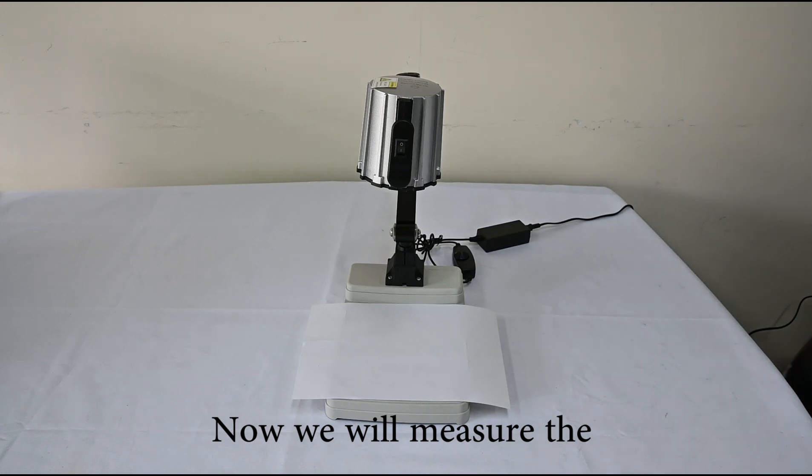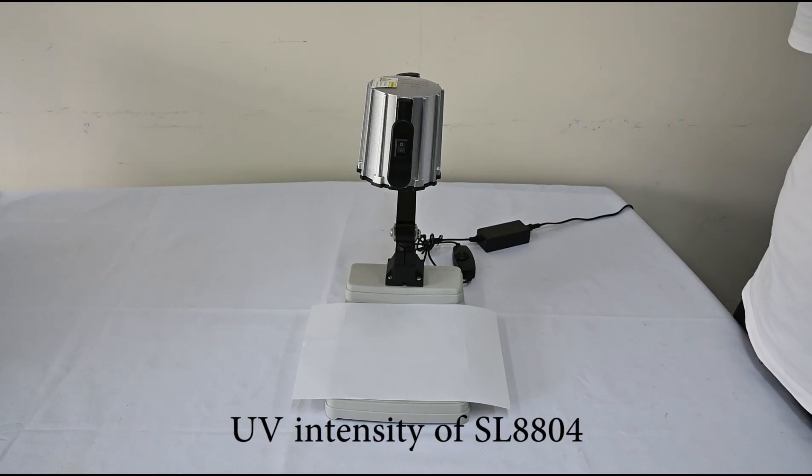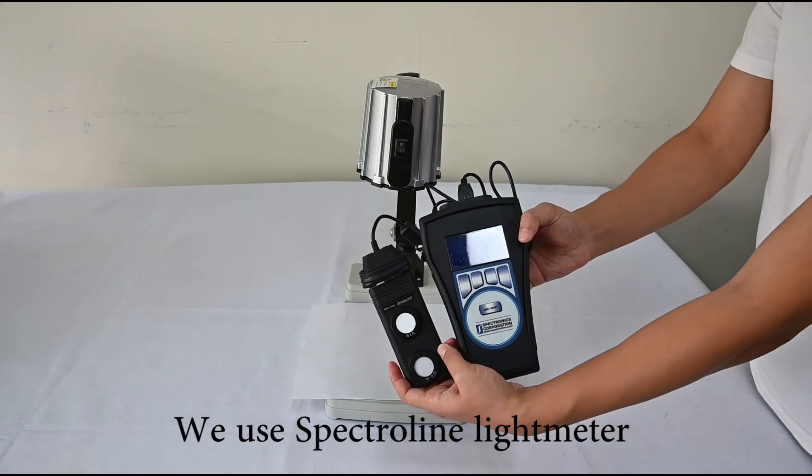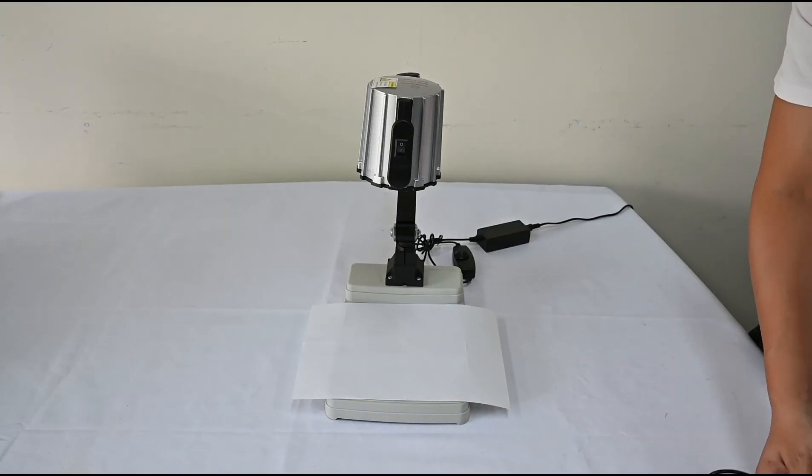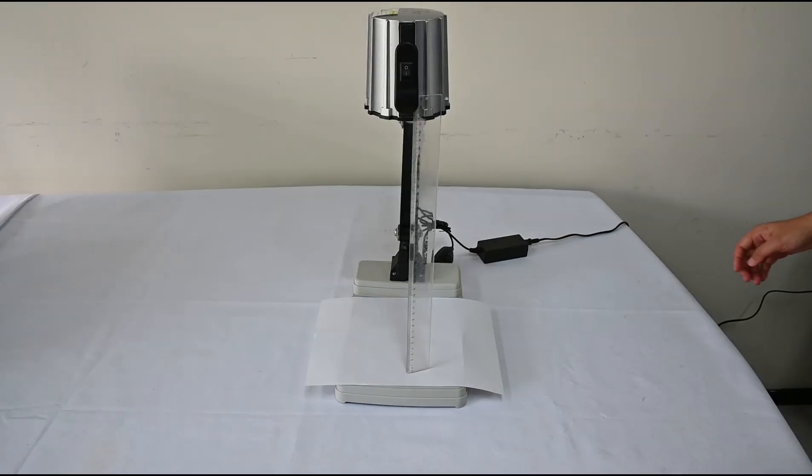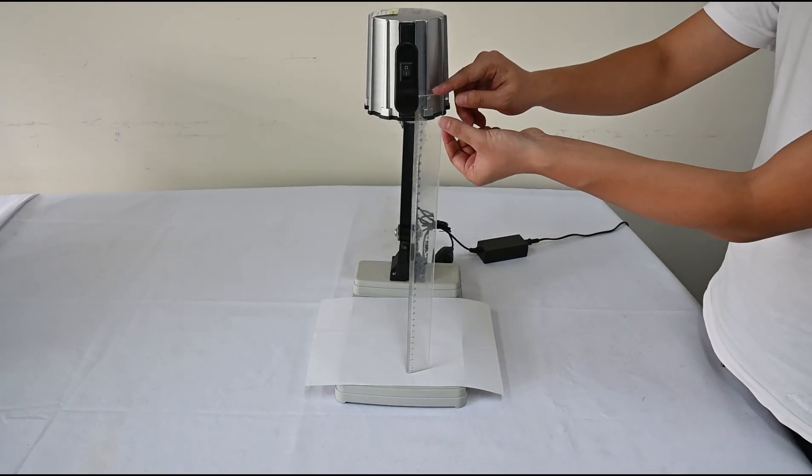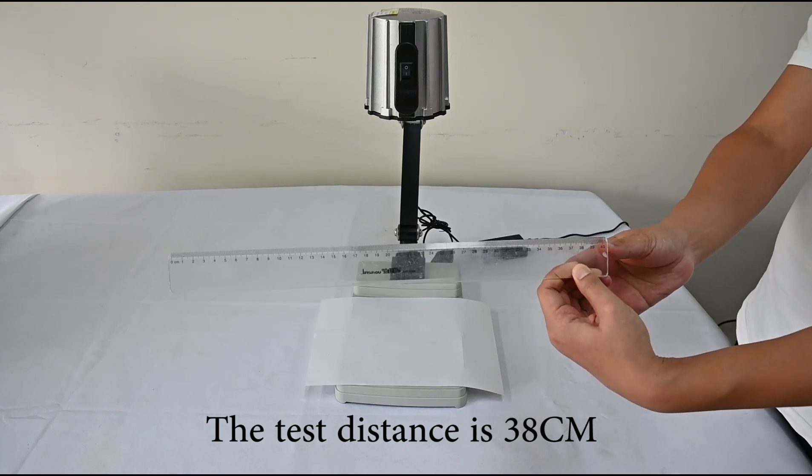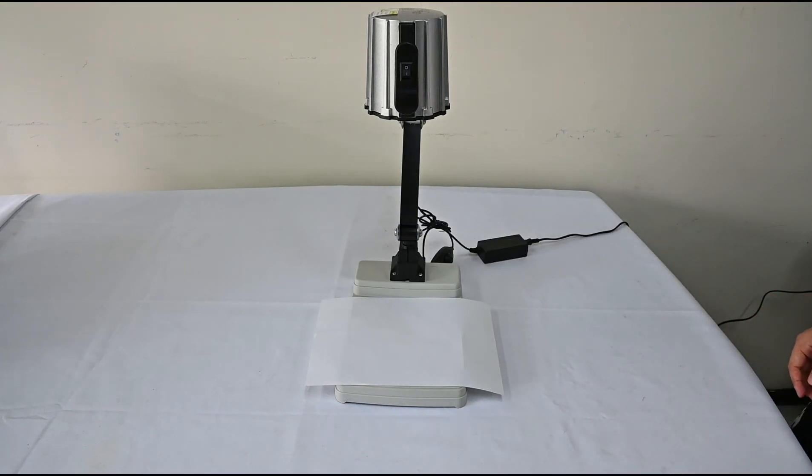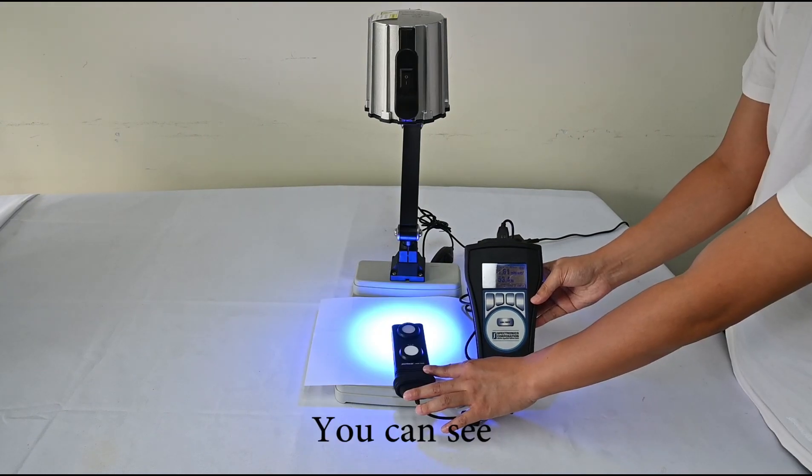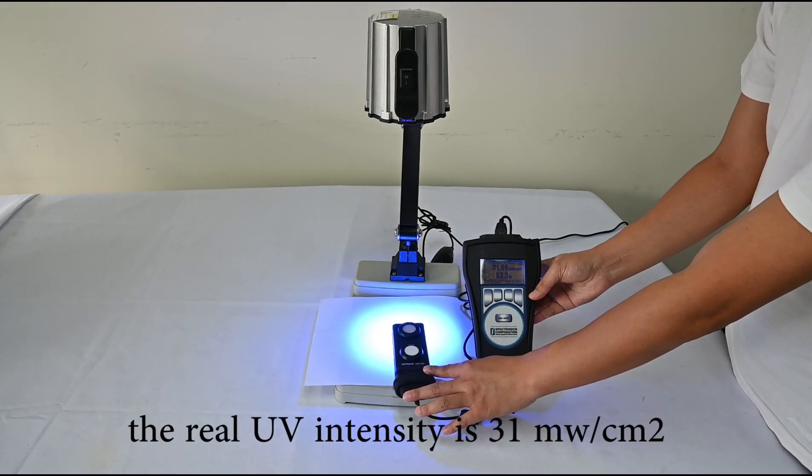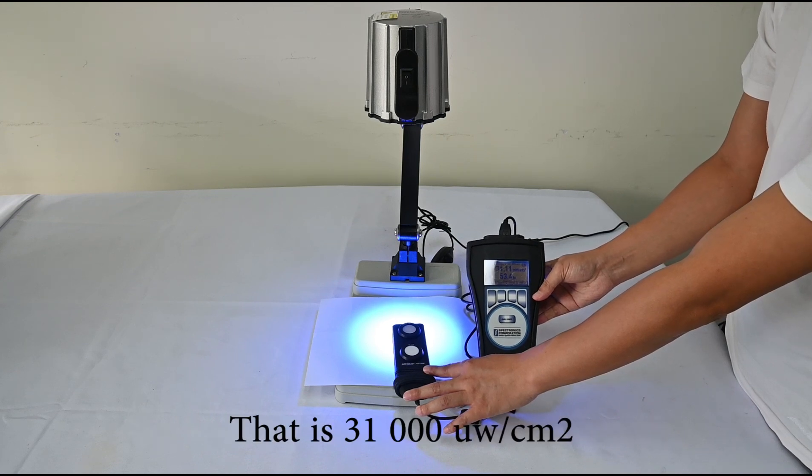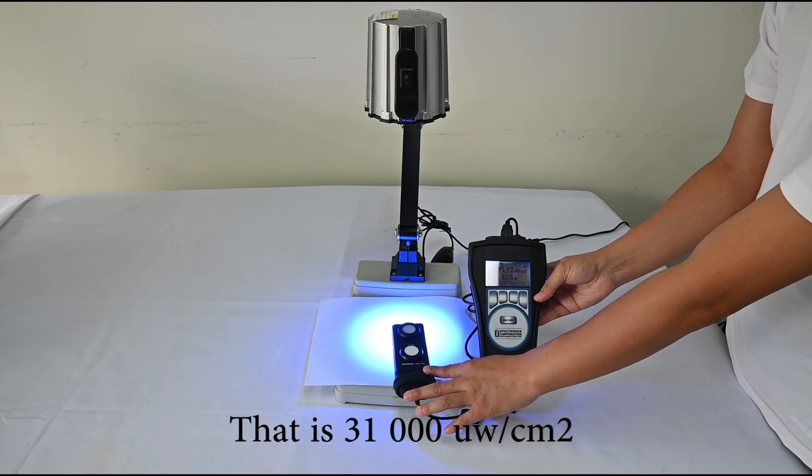And now, we have measured the UV intensity of SLW804. And to ensure the accuracy, we use the spectrolling light meter. And the test distance is 38 cm. Okay, here we go. You can see, the real UV intensity is 31 mW per square cm. That is 31,000 µW per square cm.